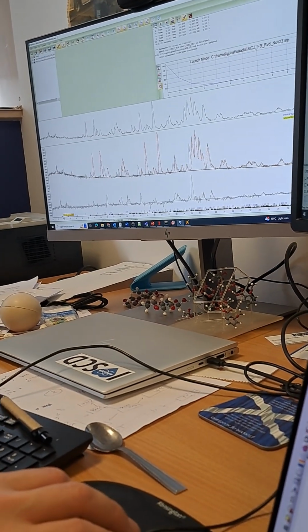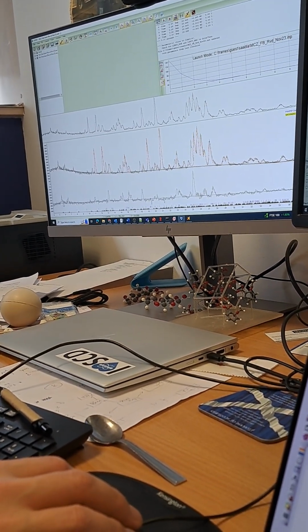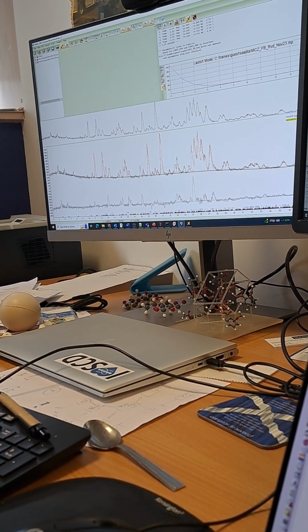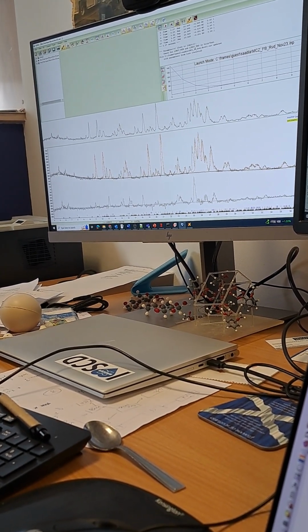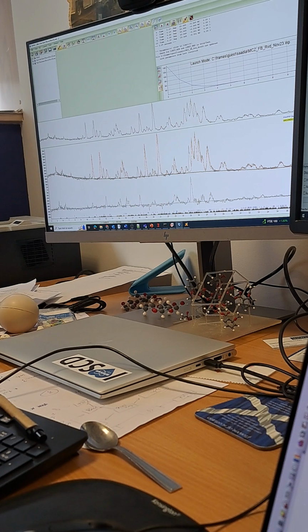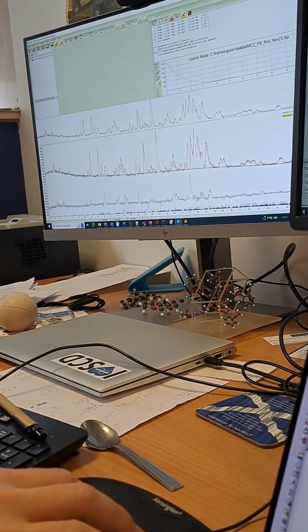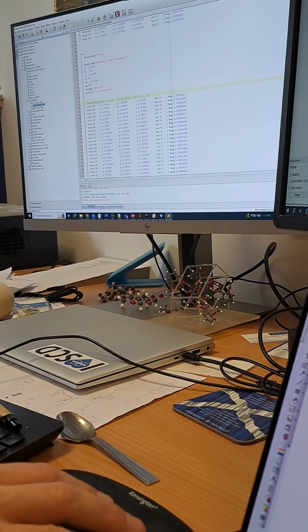Okay, so we've done this once. We may be over the right hand side of that peak now. We just want to maybe tweak it back a little bit. Okay, so we will change the beta value. No, B value. Okay, we're wanting to move it to lower 2 theta. So do we want to go up or down?